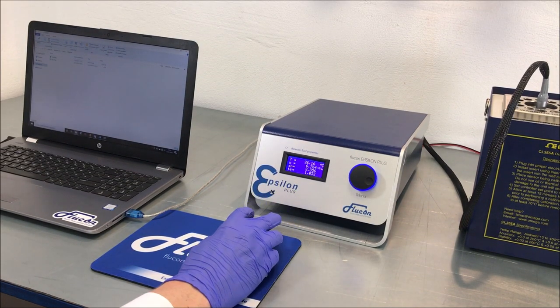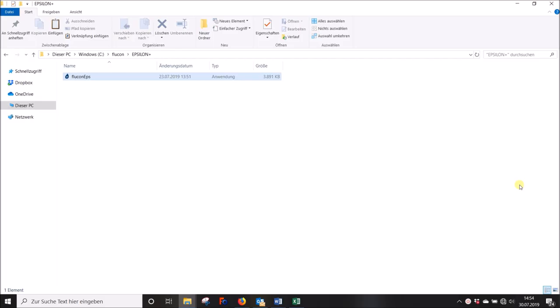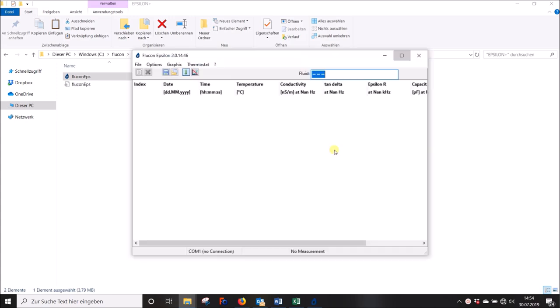Make sure that you copied your Epsilon Plus program to a directory with full administrative access. Now click on the program icon to start the software. This error message will only appear upon initial start of your program.